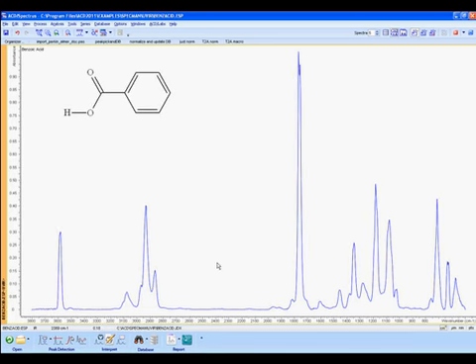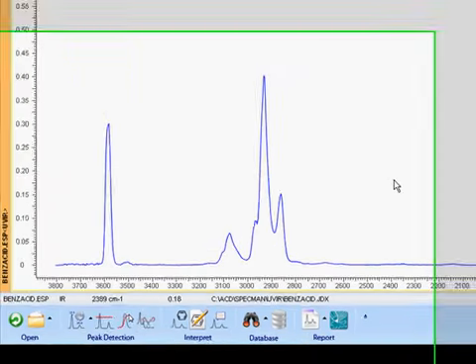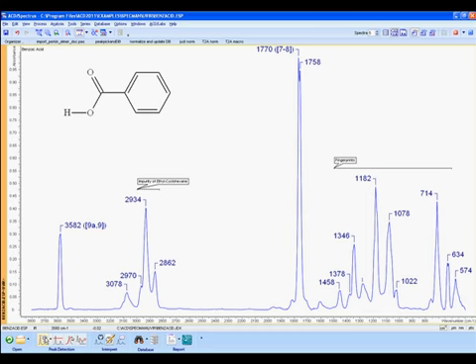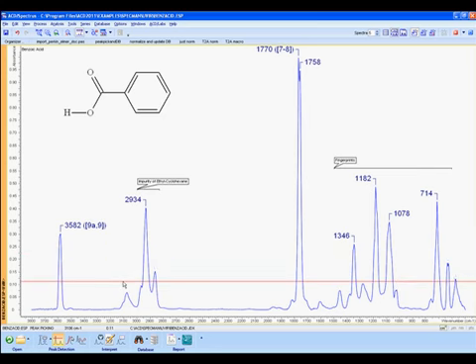Another common process we'll touch on is peak picking. Peak picking can be done manually, automatically, or set to occur when any spectrum without peaks is opened. Navigating to the workflow bar, seen here at the bottom of the screen, we can find peak detection commands. We can click on the Auto button, and it will generate peak selections based on current options. The next button, the Peak Level, produces a horizontal line we can set as our threshold. Any peak below the line is not selected, any peak above is selected.